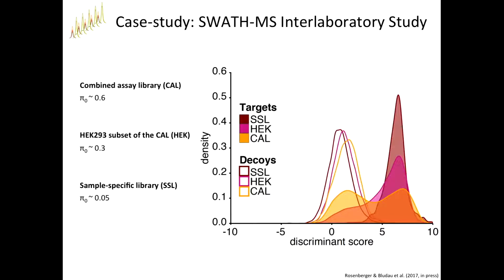The second thing is that the false targets should overlap very nicely with the decoys. So as Ludovic said, these have to match. And the next thing is that you can look at the p-value histograms and see that they really level out at some point, and that you don't have very strange characteristics shown in these histograms. These are reported from the pipelines, and you can also see them in Skyline, I think.